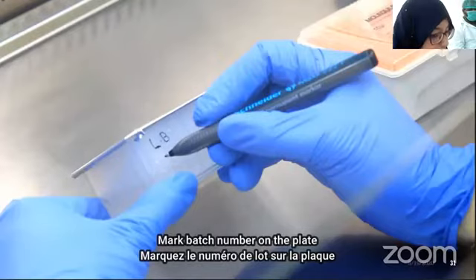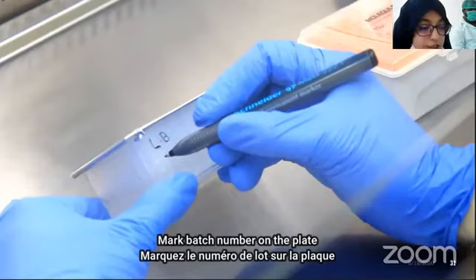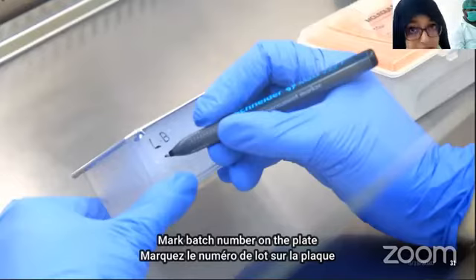Next is, how long does automation take for extraction? It depends upon the machine. We have different types of machines at IV. By using the 96 well machine, it takes around 40 minutes. And we have another machine for 24 samples, which takes around 20 minutes for the extraction of the RNA, and the 32-sample machine also takes 35 to 40 minutes to extract the RNA. So it depends upon the machine and the number of samples as well.